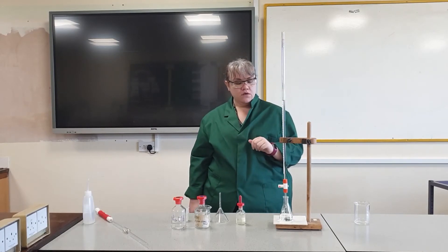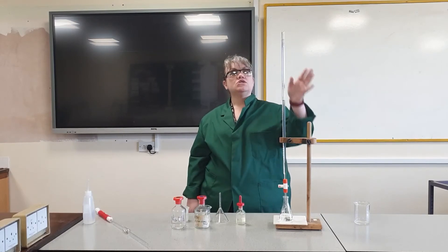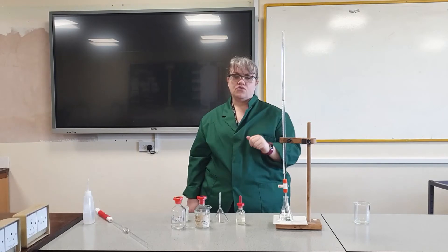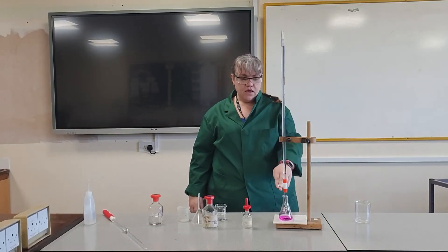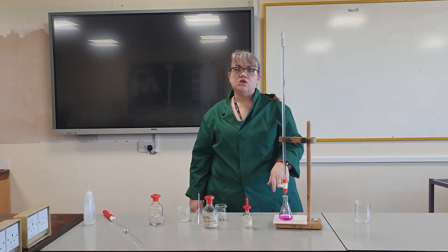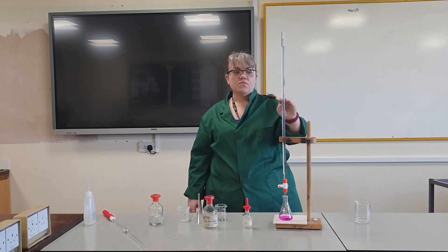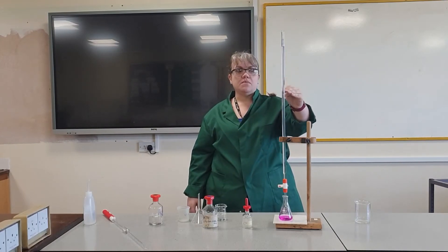So that's my rough — I now know roughly where the neutralisation happens. I'm going to reset and do my real trials. I've set up my burette with acid up to zero. I've put another 25 centimetres cubed of alkali and some drops of indicator into my conical flask. My rough took me down to 23.4, so I'm going to allow a steady stream until I get to 20.